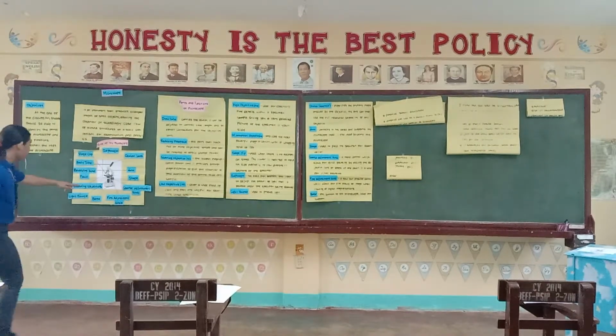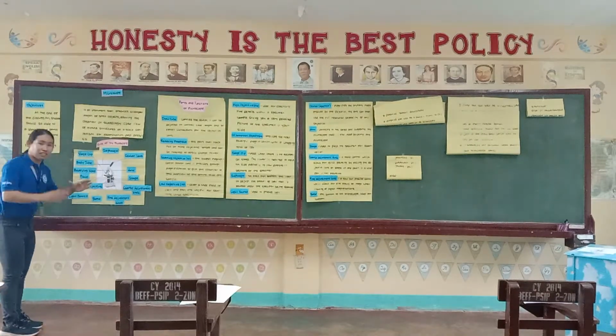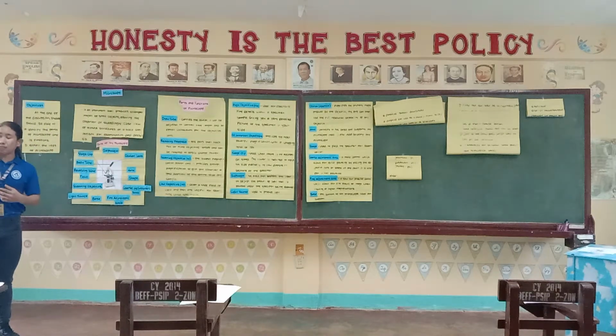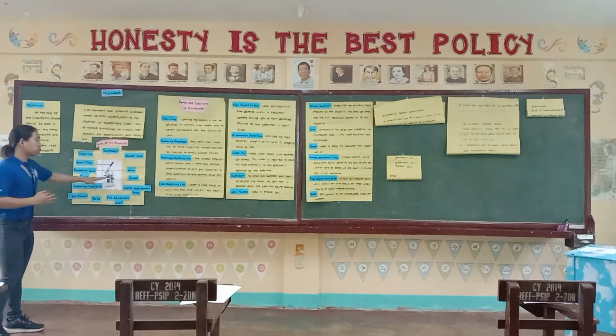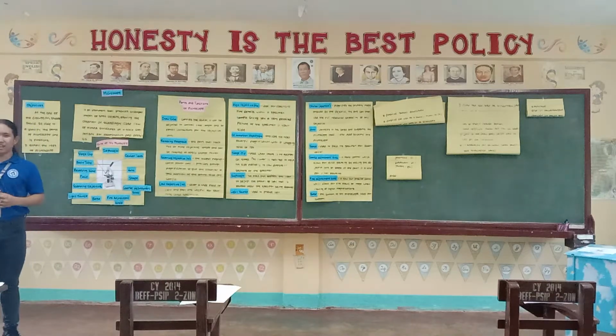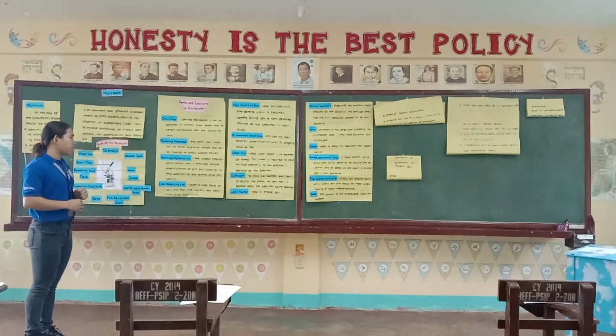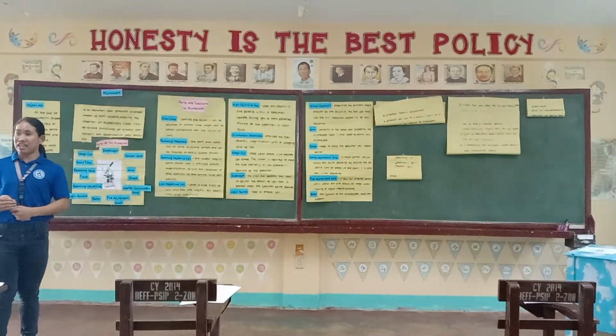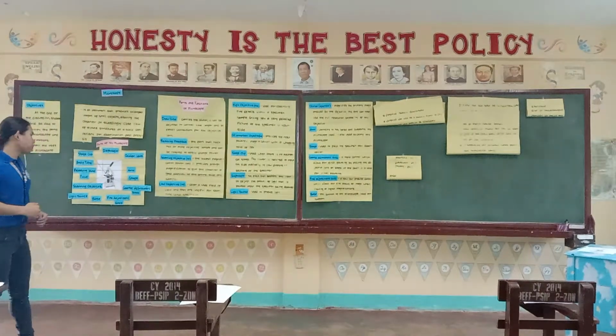So pwede din mo siya ma-adjust kung unsa ang exact amount sa light para makita nimo ang specimen nga imong gi-studyhan. So meaning, helpful ang diaphragm to enable the user to adjust the light. So ang light niya mo i-adjust.